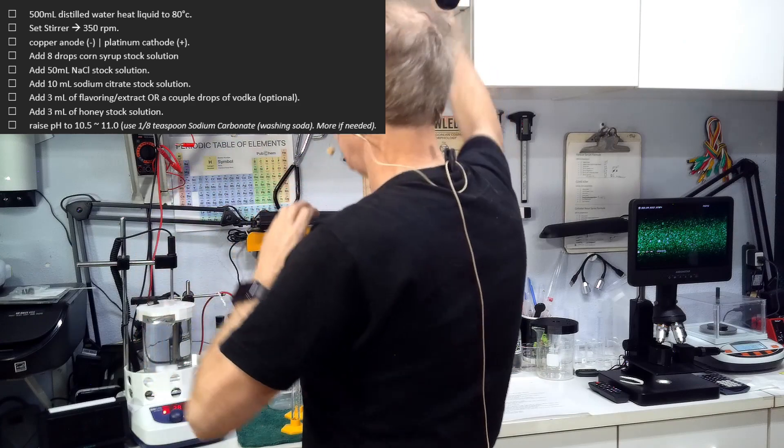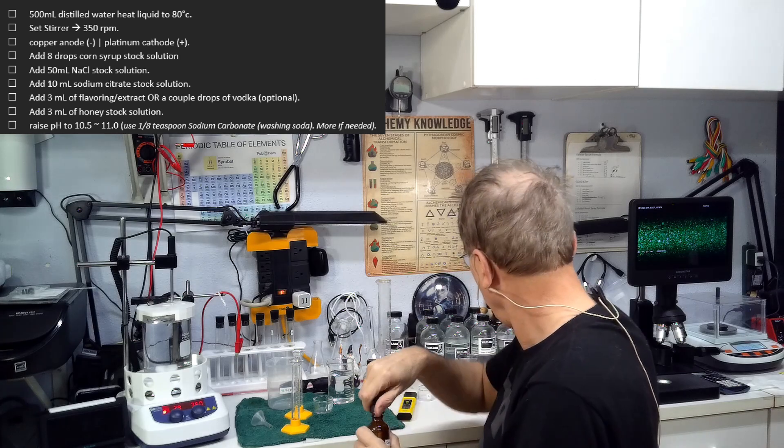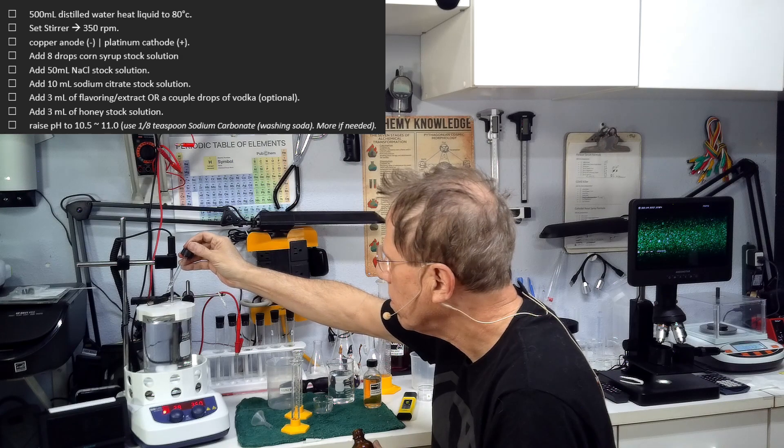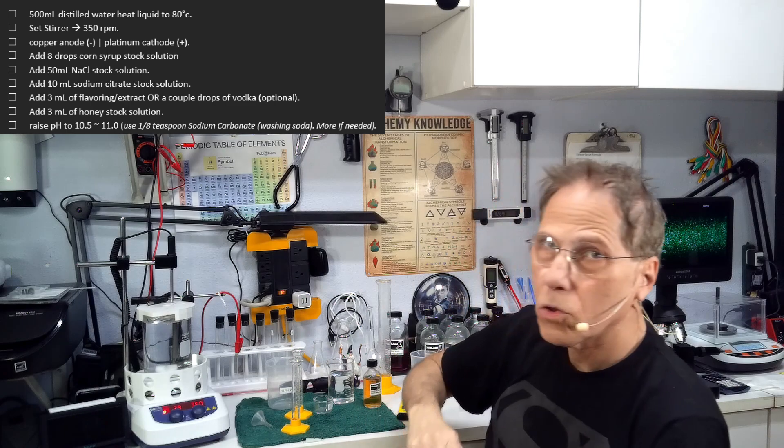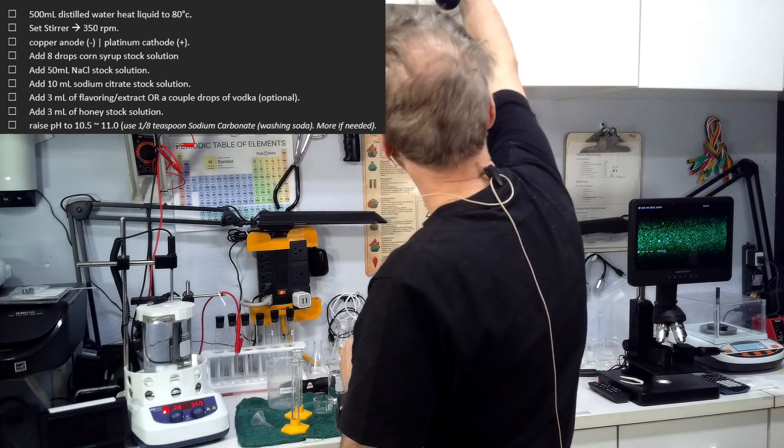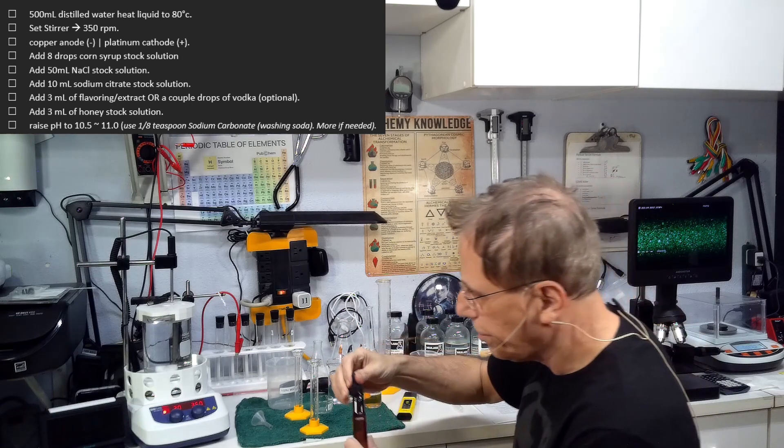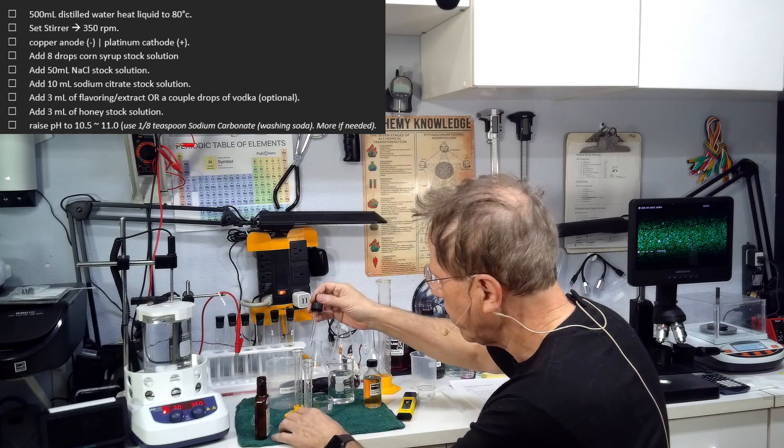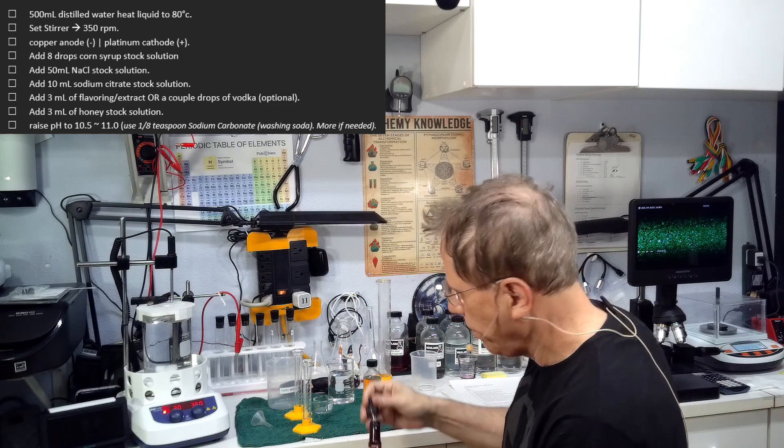We need the chlorine atom in the salt to help liberate the platinum. Corn syrup from our gold thing, we're going to use eight drops of corn syrup. Corn syrup helps bind the colloidals together.